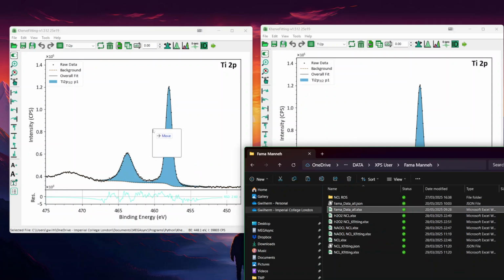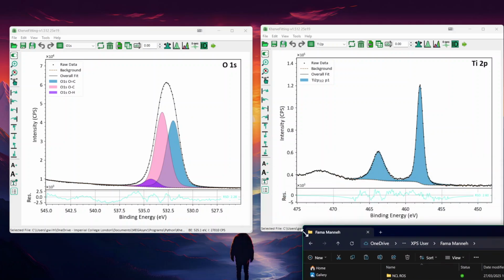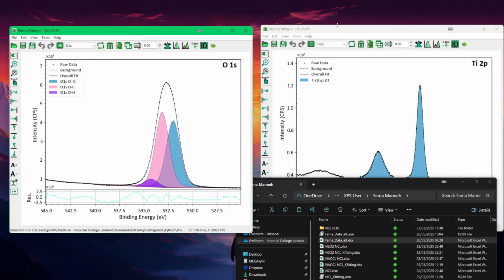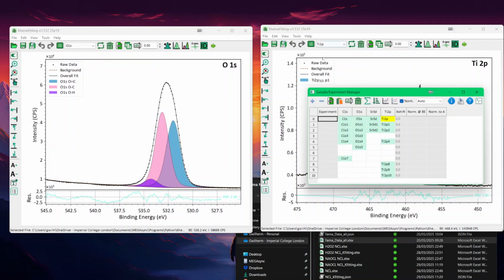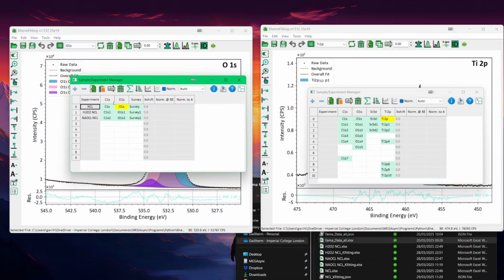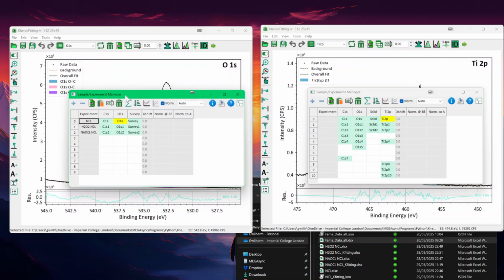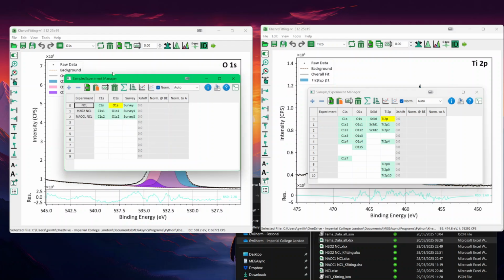The old data. Okay, so preparation is sometimes a bit difficult or a bit long, but now let's say you have this data and you can open the sample manager. So this was my sample of this one. You can see that I've been playing with it, so it's made of many core levels. And this is more of my quite nicely made sample. So I can then copy.